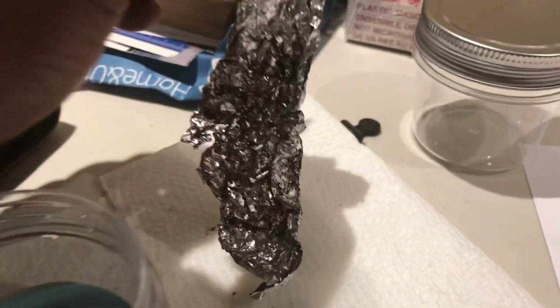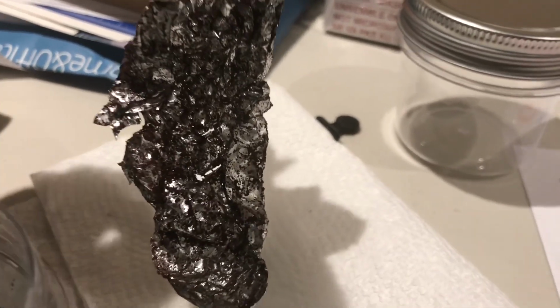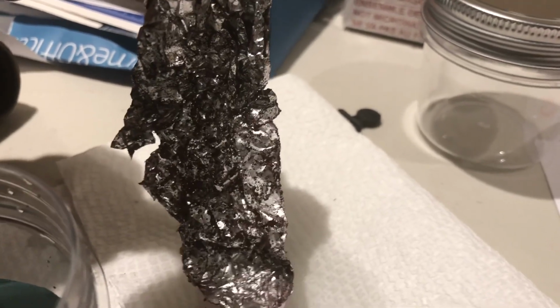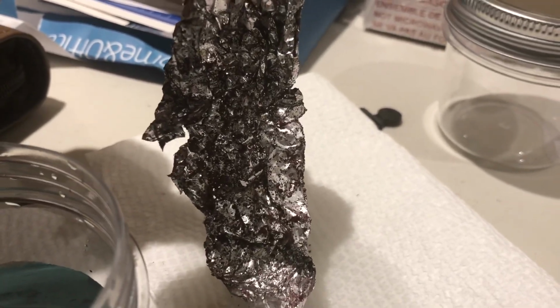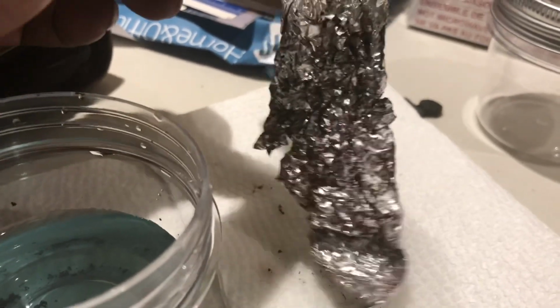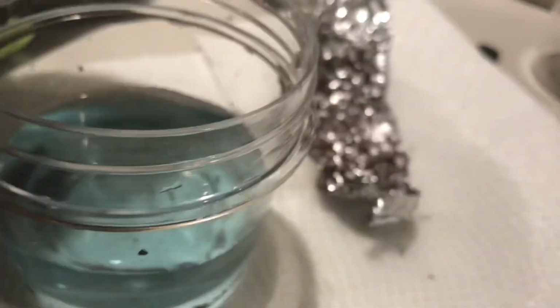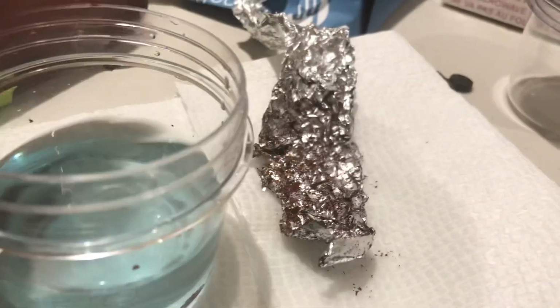And once again, see if you can see it. Remember the original color of the copper versus this one? That's leading into our topic of oxidation reduction. We'll talk about this more in class. I don't want to give away too much, but this is a simple demo showing oxidation and reduction in live action. Bam, see the copper residue right there. Pretty cool. All right, take care.